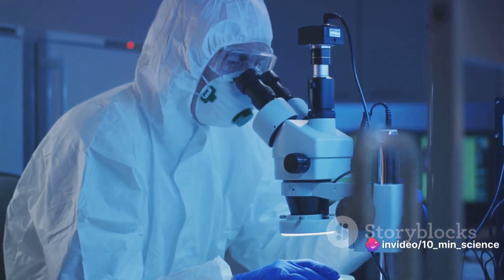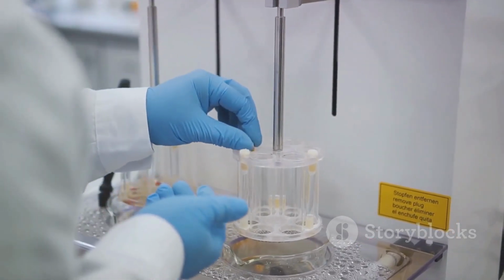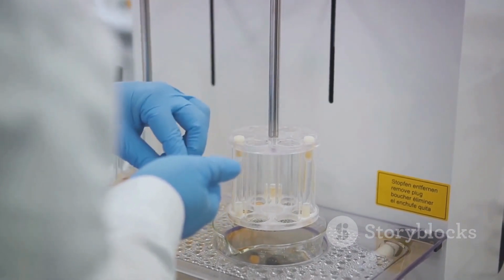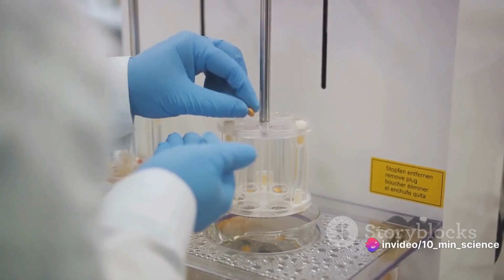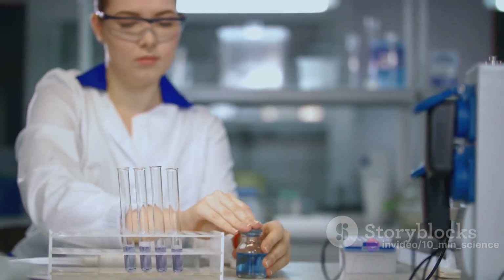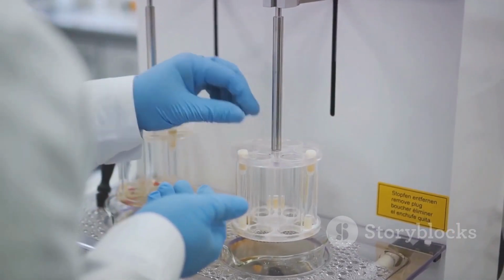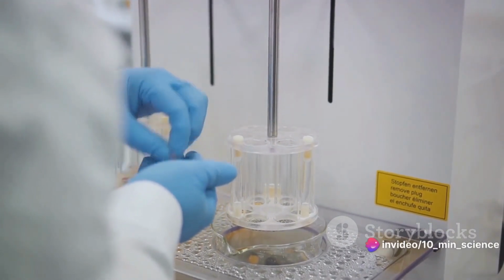If the absorbance of the sample is higher than the standard, it indicates a higher concentration of alginates. Conversely, a lower absorbance suggests a lower concentration. However, it's not always as black and white. Factors such as sample preparation and instrument calibration can impact the results, so it's essential to consider these variables during interpretation. Once we've interpreted the data, we move on to reporting.